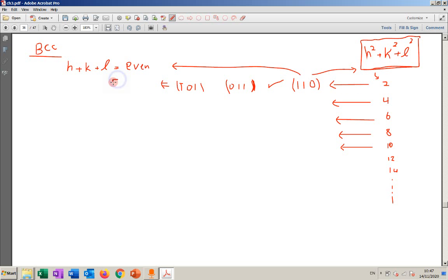So the family, basically, that their square is equal to 2, all of them will be for the first category. So we can say a family of 1, 1, 0, all of them. All of those planes will be seen firstly. Why? Because their summation is even and their square will be 2. Now let's go for number 4.